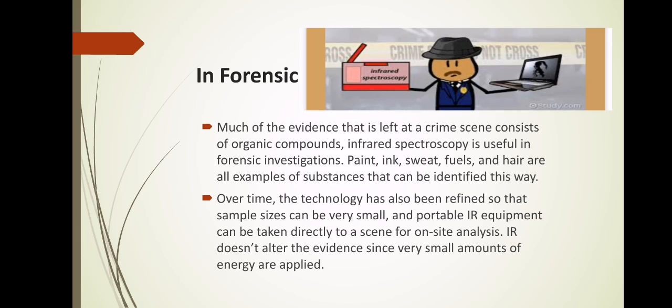Infrared can also be used on fibers, which are often found at crime scenes. It is even possible to determine if hair has traces of hairspray with infrared sample preparation.